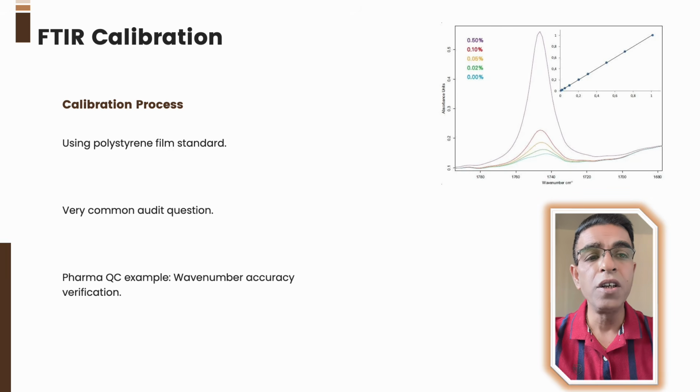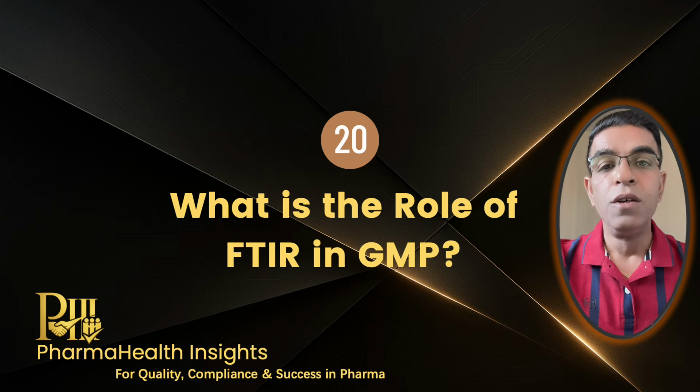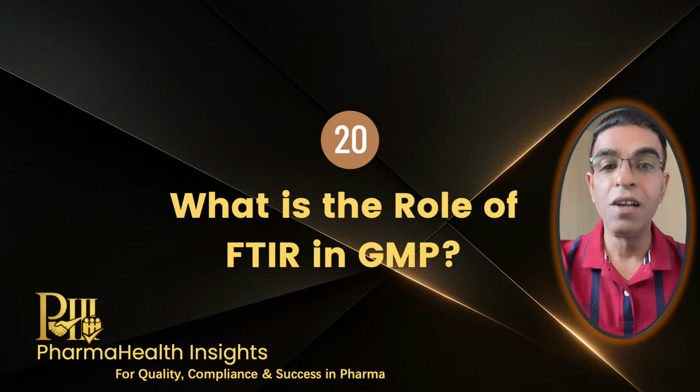Then add the audit relevance. This is a very important point not only for interviewers but also from an audit and GMP compliance perspective because calibration ensures the instrument is performing correctly before the routine analysis. This answer shows strong regulatory awareness from you. So friends, excellent work. Before winding up, you can expect a last question.